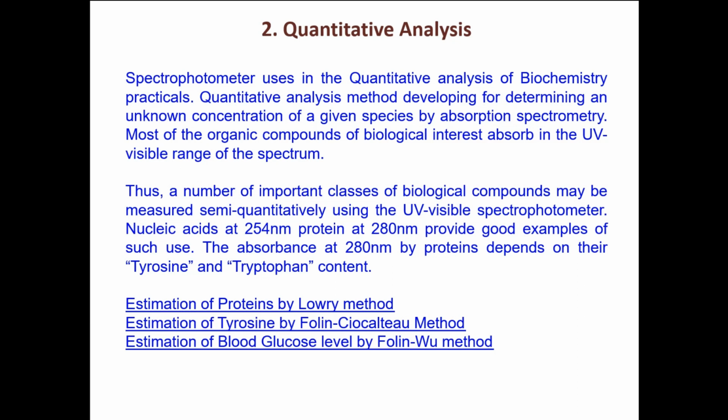The next one is enzymatic analysis. As biochemistry students, it is most important that you all know how we can characterize enzymes, especially by using spectrophotometric methods, and how we can estimate the activity of an enzyme. When we look at the activity of an enzyme, we have to be very sure that we are not making any mistake in that.